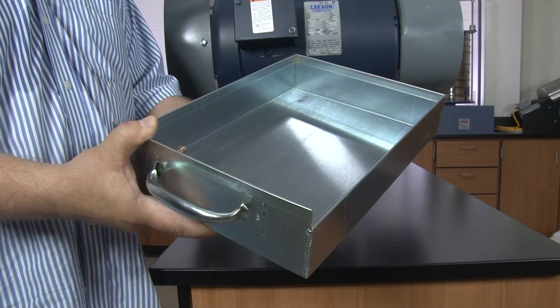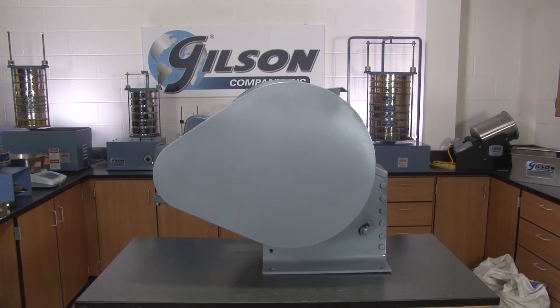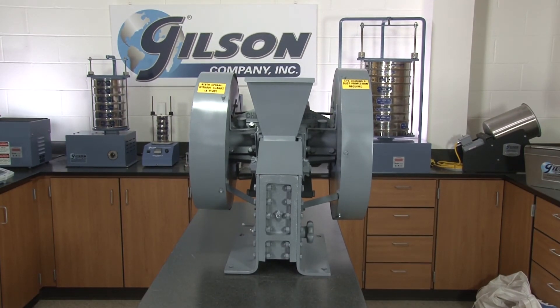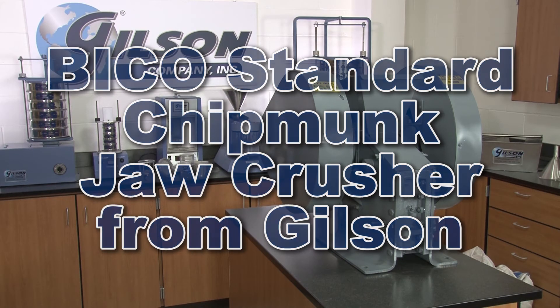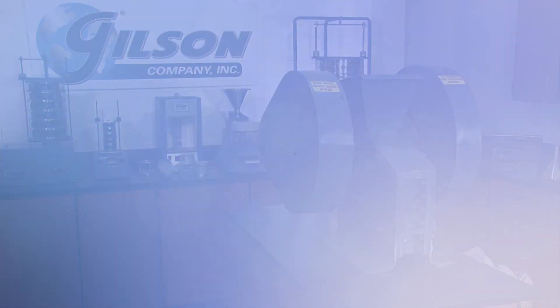A sample pan, feed hopper, belt guards, and flywheel come with either unit. All components can be easily reached for cleaning and maintenance, making the BICO standard chipmunk jaw crusher offered by Gilson the right choice for your material crushing needs.